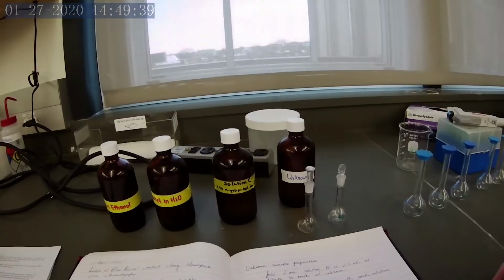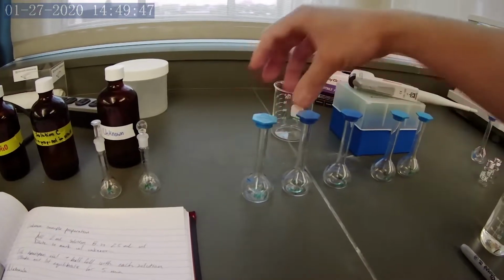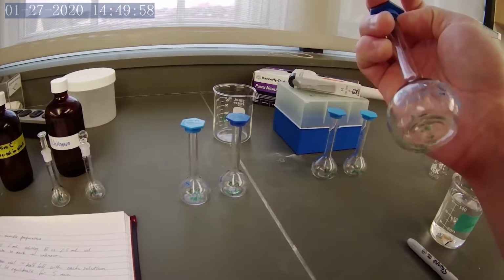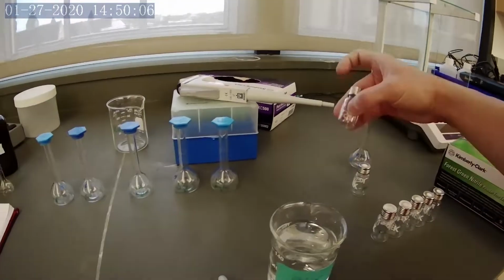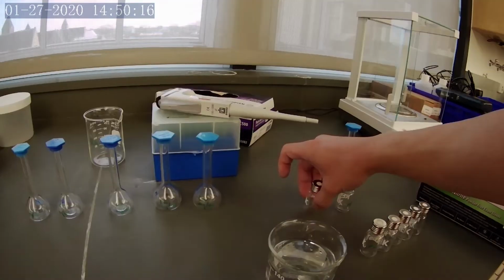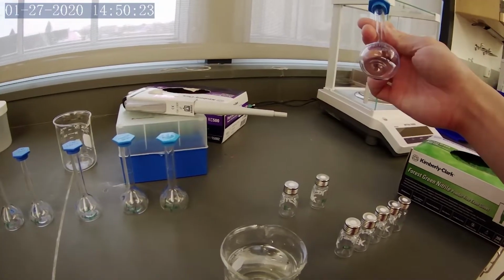I have two 10 mL volumetric flasks for reference samples R1 and R2. And then I have a bunch of 25 mL flasks to make the standard dilutions and to dilute the unknown. In addition, we have the headspace vials that we're going to fill about halfway with our solutions and then sample the air above the liquid and actually inject that into the GC.